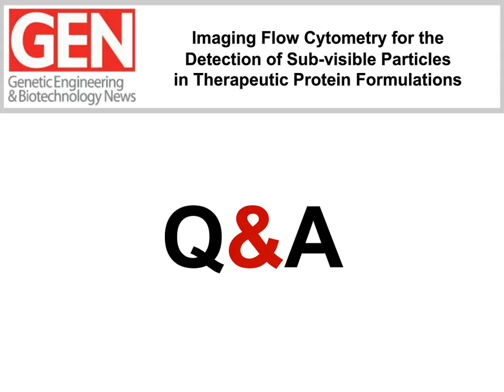So our feeling is that ultimately we're going to use a combination of morphological parameters based on the bright field image and fluorescent parameters in order to be able to discriminate these particles. And we're still working on this development. But our goal is to be able to discriminate particles 2 micron and up using the ImageStream and 5 micron and up with the FlowSight at least. Okay, great.